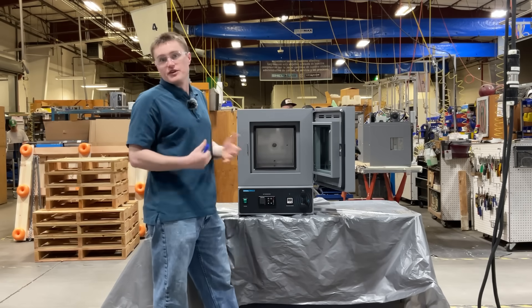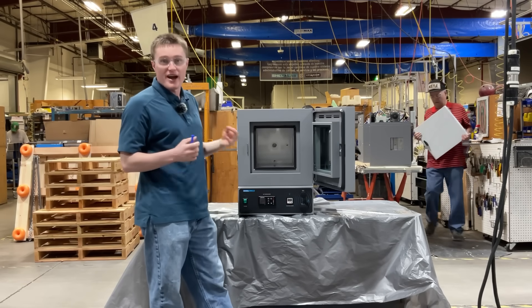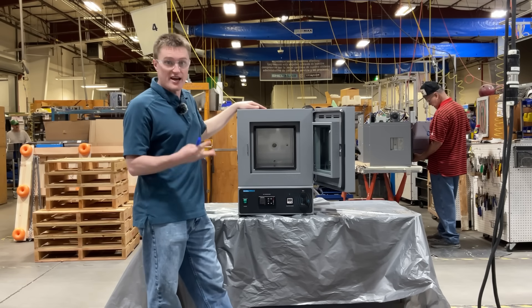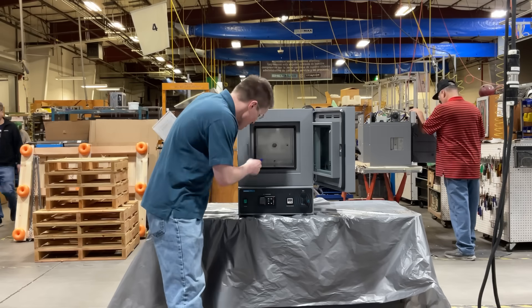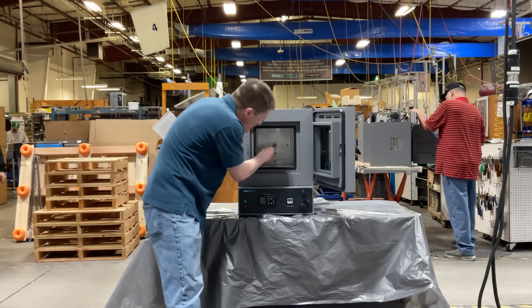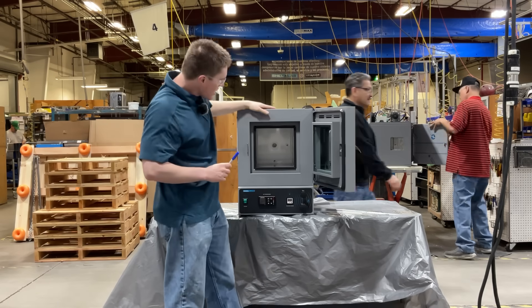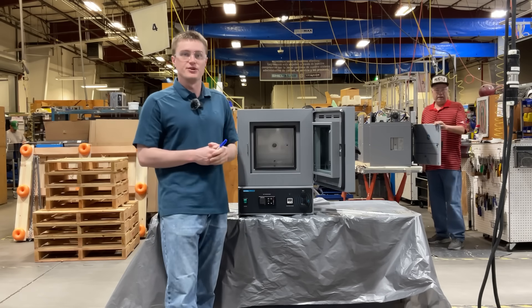The S-Vac-1 features a one cubic foot chamber, ideal for compact applications such as bench tops. Each unit is included with three shelves at standard. Also located inside the chamber is the temperature probe in a KF-25 fitting that we'll explain in a second. The chamber has been constructed out of corrosion-resistant materials to help increase the longevity of your unit.